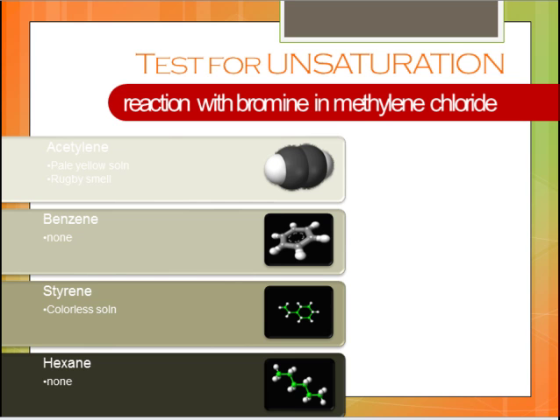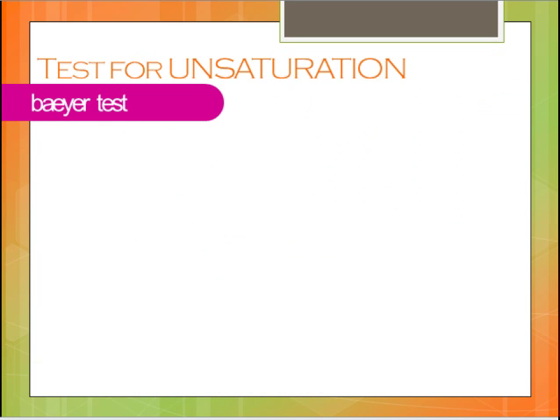Well, wasn't that interesting? Now getting back on topic. The next test for unsaturation is the Baeyer's test.